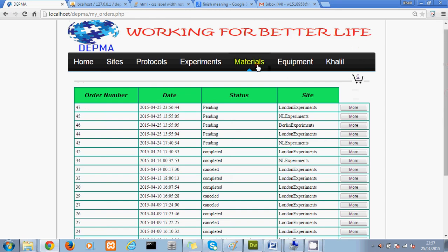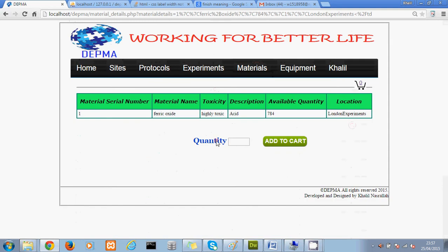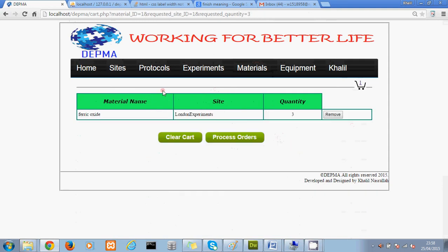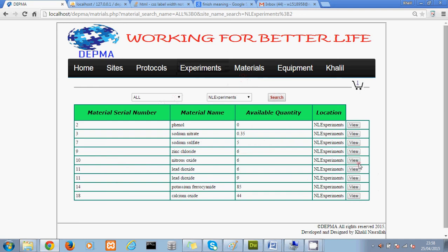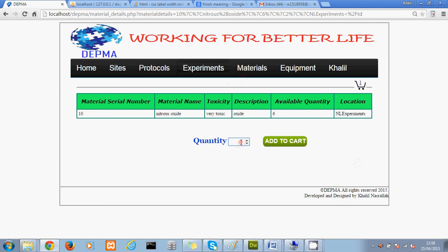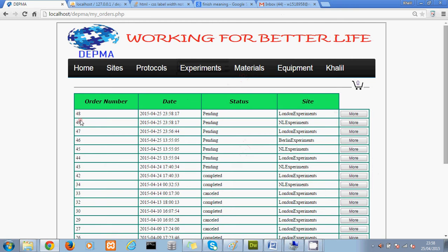47 material, the biggest one was 47. North London and London Experiments, material all, North London, search. Let's give it nitrous oxide. Let's give it 3. Place order, 2 orders should be generated. Yeah, 48 and 49. I don't know why the system took 13, not 23. I'm not understanding. There might be something wrong with the time in the system. Anyway, let's get back to that.